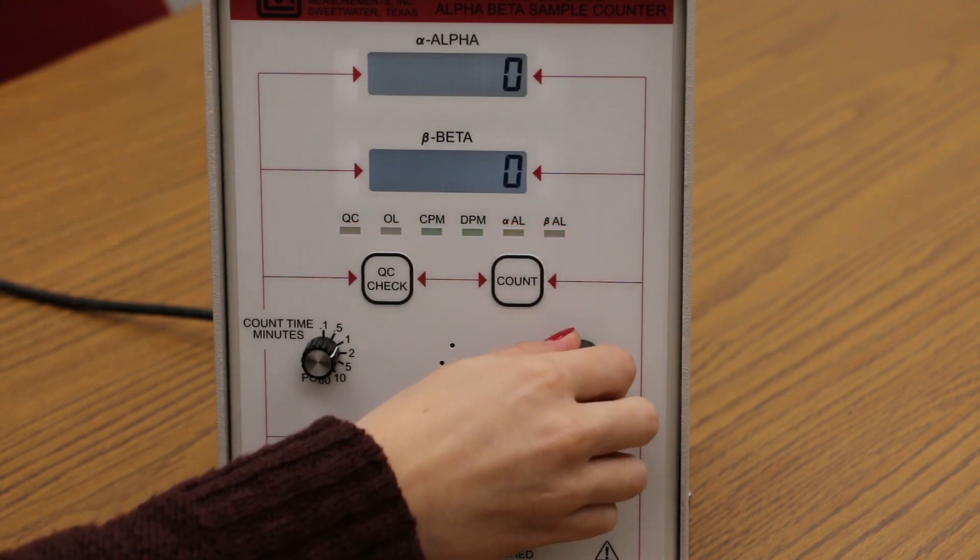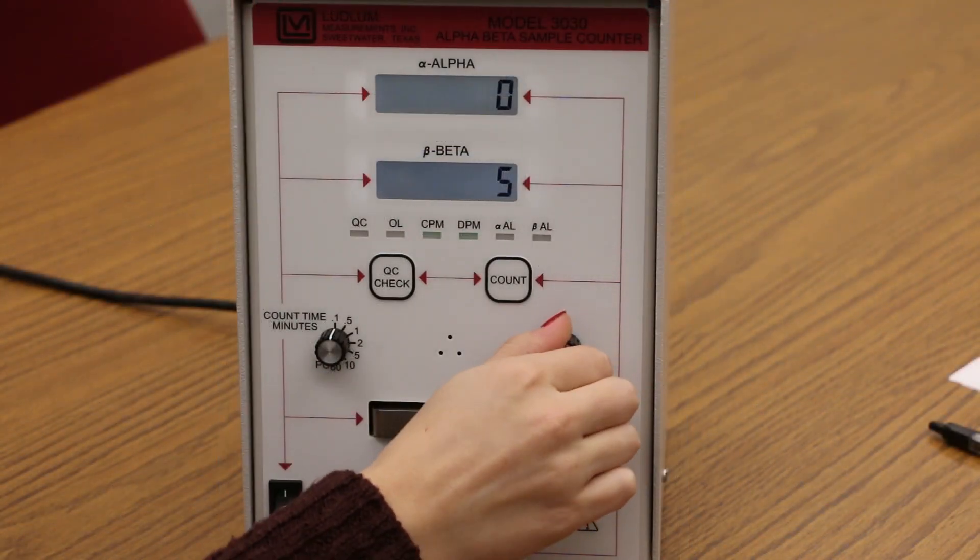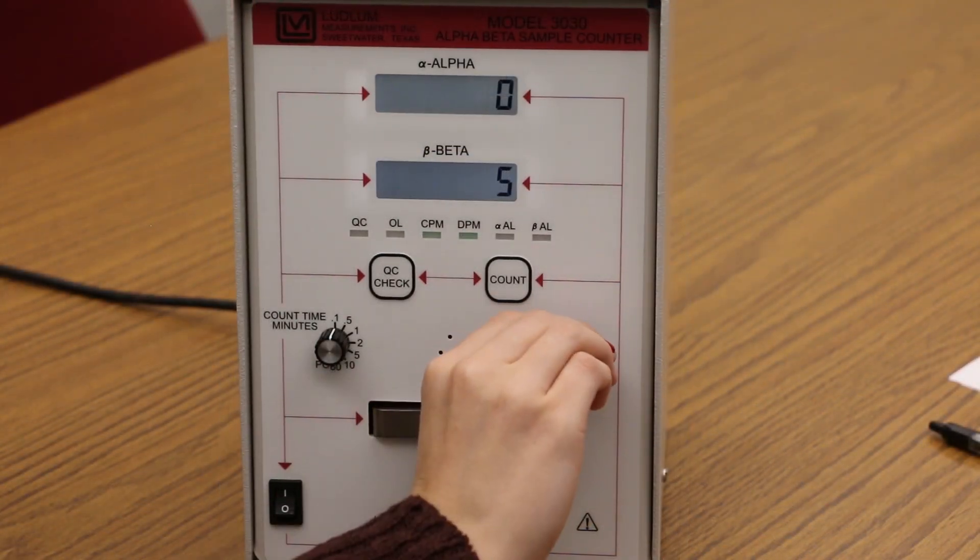Adjust the volume of the speaker to the desired level with the volume knob. The alpha and beta clicks have a different tone to help distinguish them from each other.